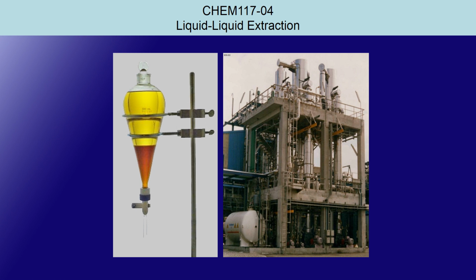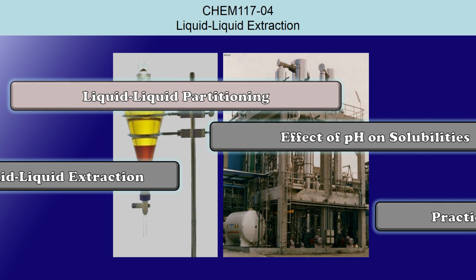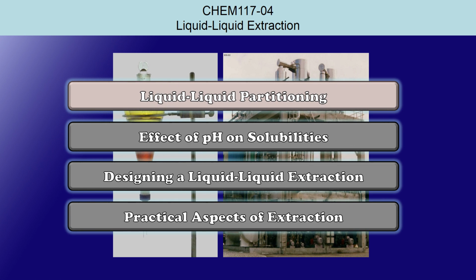Welcome to the Fundamentals lecture for CHEM117 Experiment 4. This week we'll be talking about liquid-liquid extraction. Specifically, we're going to talk about liquid-liquid partitioning and what happens when we have two immiscible solvents that are competing to dissolve a non-volatile organic compound.